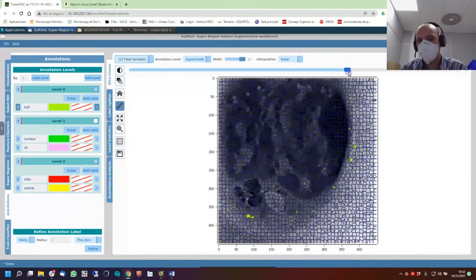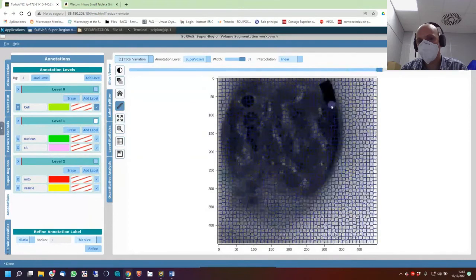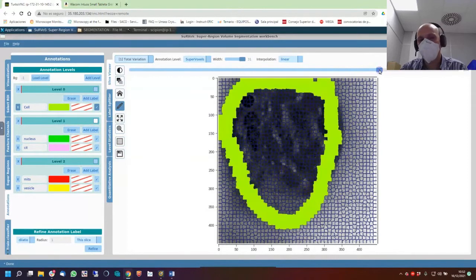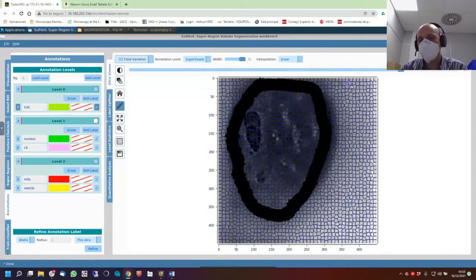Cell is here. Here, and I'm moving theta. Cell is here. I'm doing the thing fast. It's time consuming. You need to be as careful as you want. Okay.